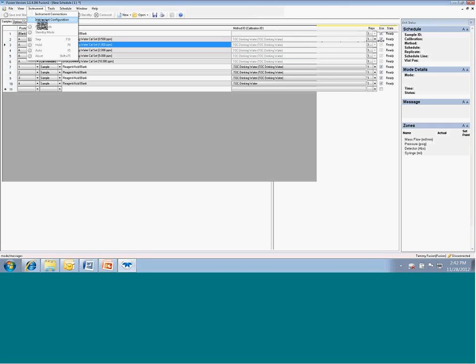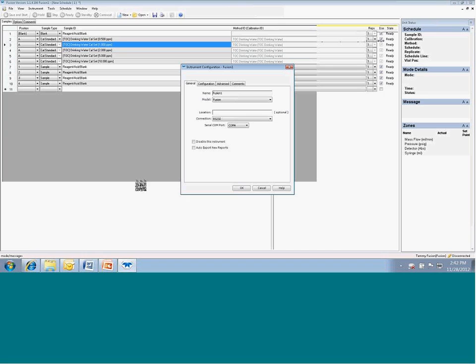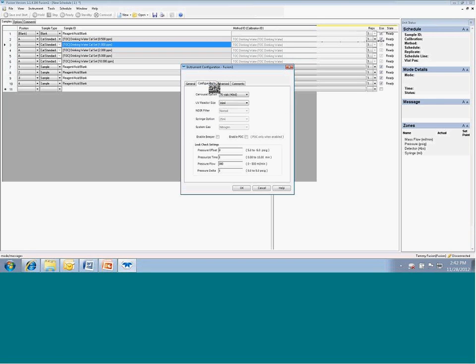So you want to look at this instrument configuration. It's just an overall view. It can connect via RS-232 or Ethernet. The configuration enables me to choose. So the standard is 75 vials, which uses the 40 ml VOA vials. But there are separate carousels also for 55 ml vials and for 20 ml vials.